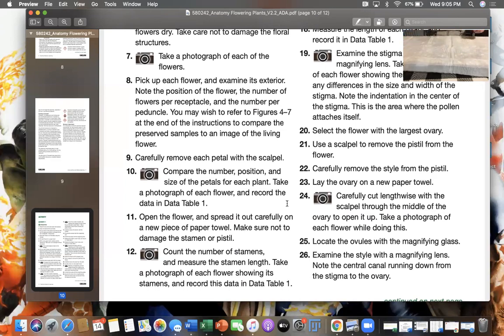We'll get that out of the way. There. You're going to fold up your absorbent thing. Don't touch the absorbent side at all. Just roll it, fold it in upon itself. Like I said, I'm using a box as my trash bag. Go right into the trash can.